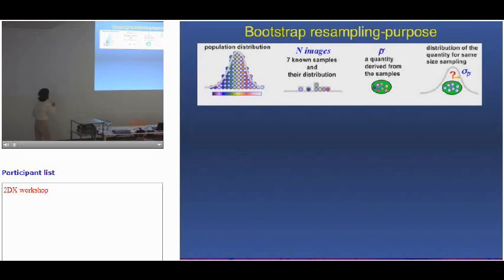In general, that's not a very easy thing to do because you probably only did this 7 times. If we are talking about our 3D volumes, it's good enough when you get one map, not to mention getting the real population. So you end up having to estimate.